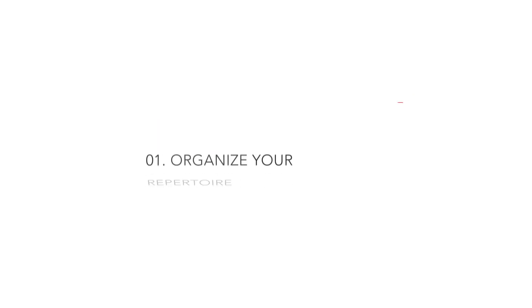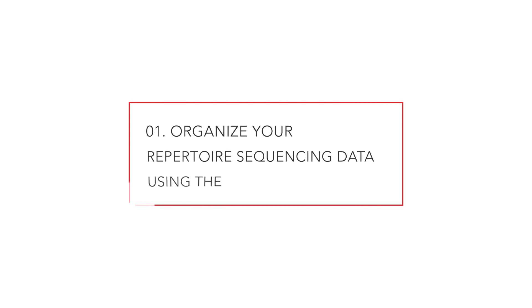In this video, we will show you how to organize your repertoire sequencing data with the IGX platform clone browser. Repertoire sequencing is a powerful tool that provides high-resolution snapshots of the adaptive immune system.